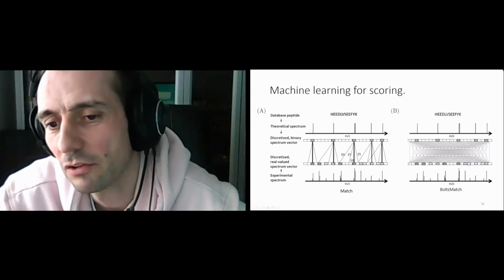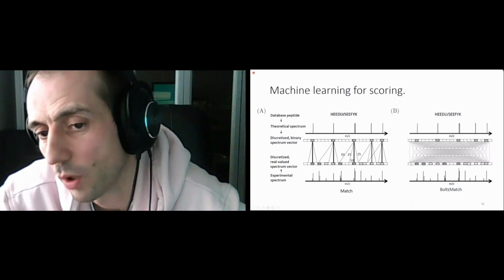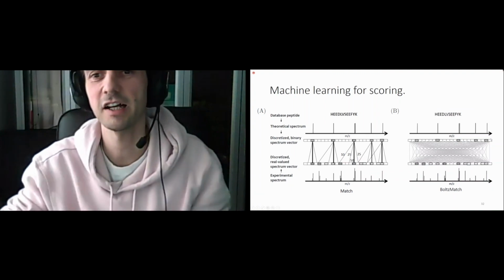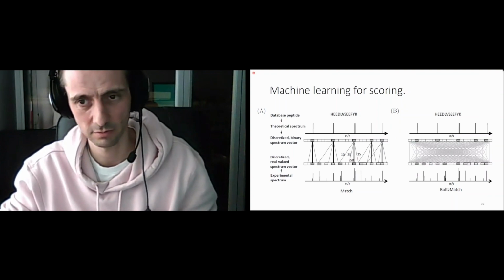So here, usually we can observe the range which goes from 0 to 2000. And then if you discretize the horizontal axis with integers, with one mass of the proton, then you will get a component of 2000, right? And then you do the same for the theoretical, then you will have 2000 times 2000, you will have 4 million parameters, right?